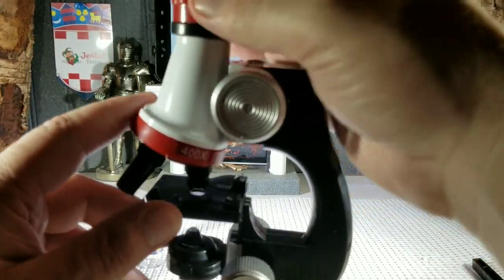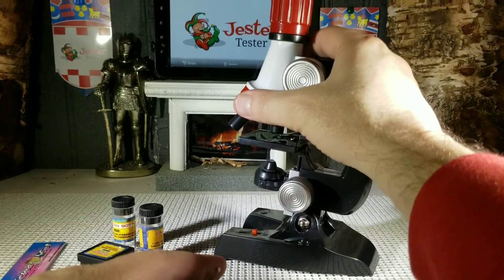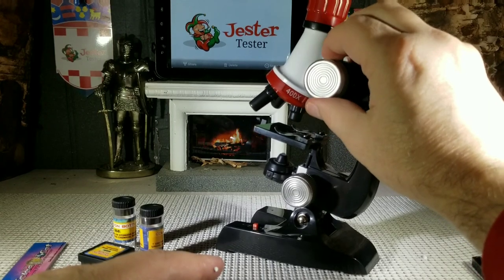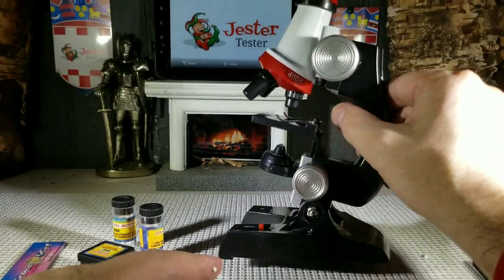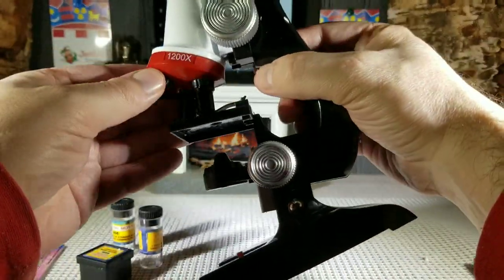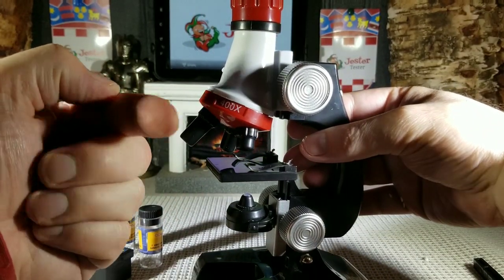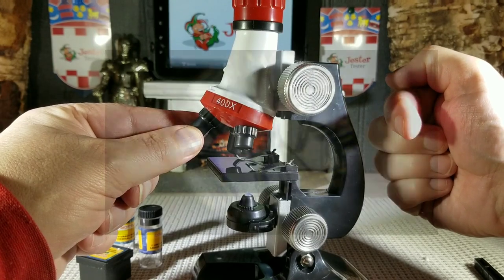You have your eyepiece, which is a focusing eyepiece — it does focus your eyepiece. You have your coarse adjustment knob. You have your different size lenses: 400 times and 100 times. For a toy, the lenses do work great. In a little bit I'm going to show you pictures of the specimen they gave you — the straw specimen — at 1200 magnification.